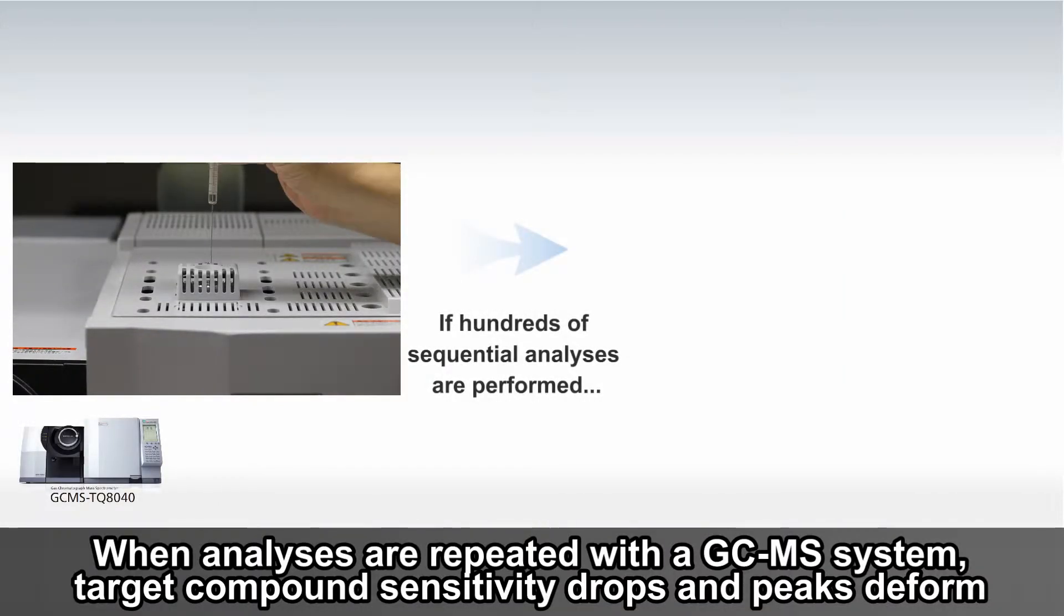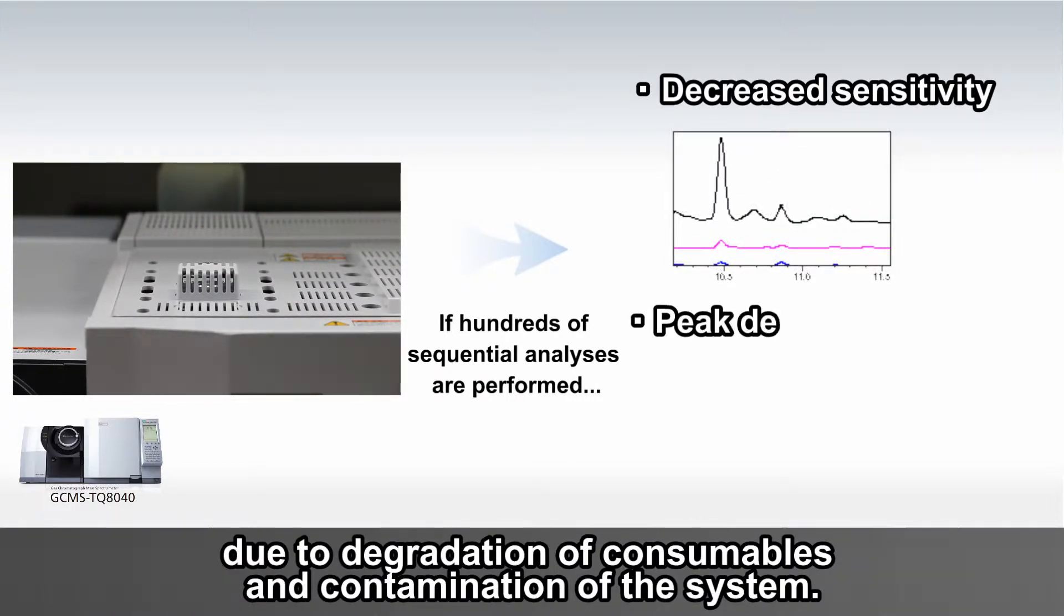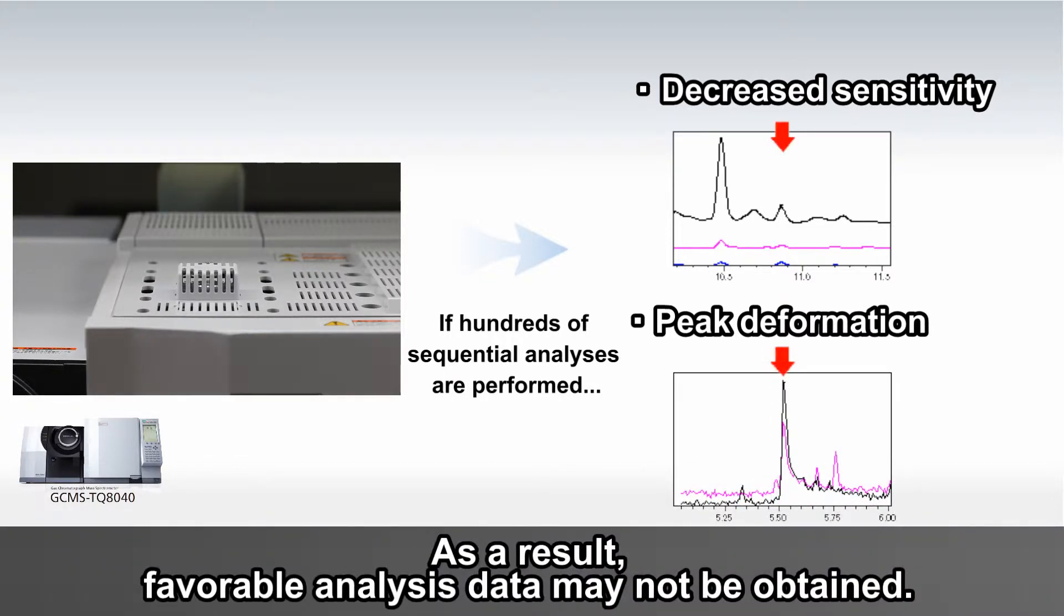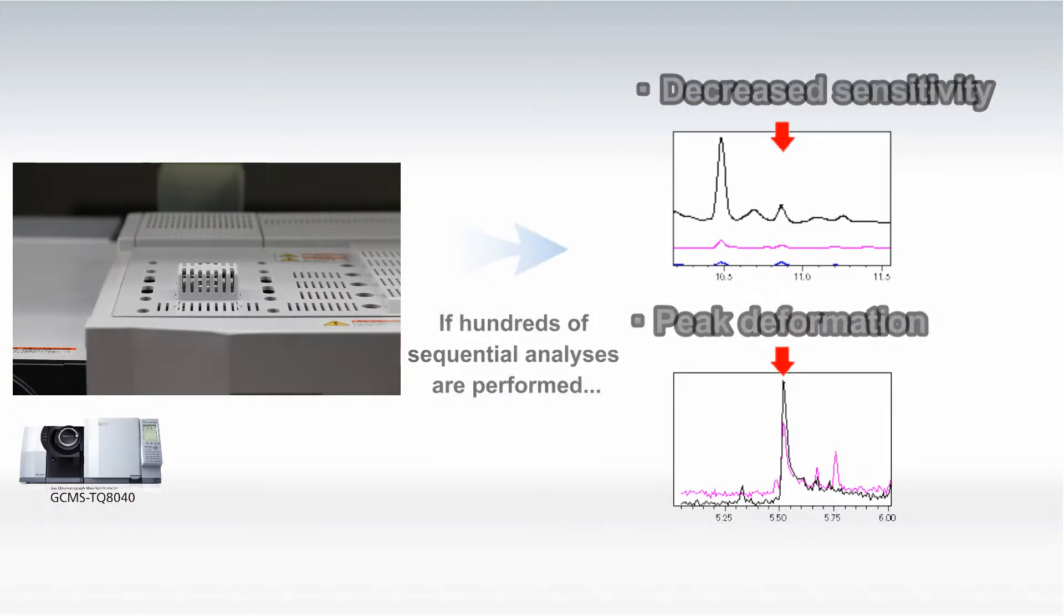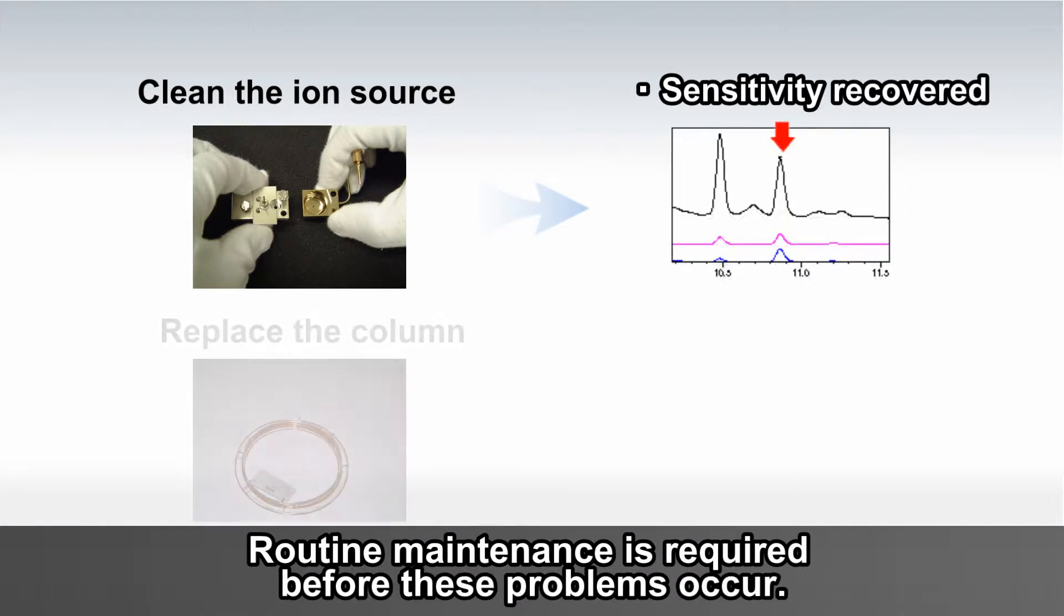When analyses are repeated with the GC-MS system, target compound sensitivity drops and peaks deform due to degradation of consumables and contamination of the system. As a result, favorable analysis data may not be obtained. Routine maintenance is required before these problems occur.